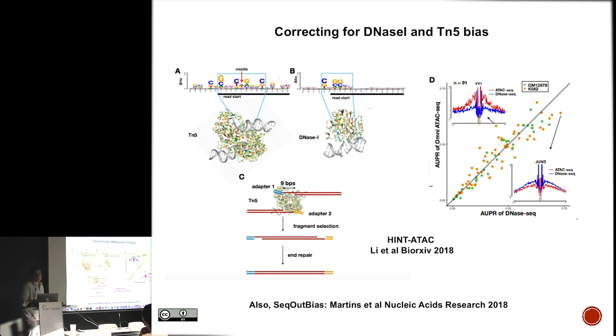So taking into account this footprint analysis, it's good to understand the potential limitations and issues when you're considering these kinds of analyses, when you want to say that this is truly a representative footprint of a given factor. And Gordon Hager and many others have looked at modeling the activity of how transcription factors bind to DNA, looking at rates of binding on and off, kind of kinetics, for mapping these kinds of features.